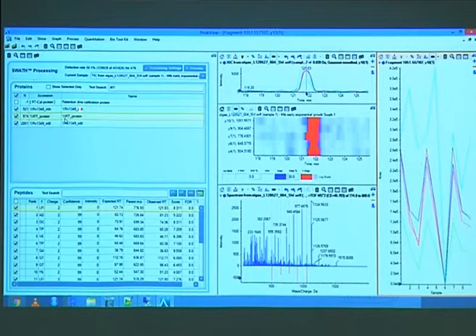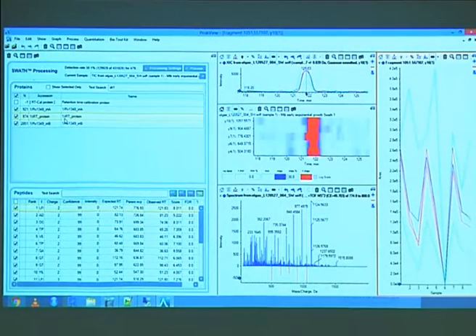Since it is a duplication of assays, since we get the information for that protein anyway, I usually don't do it. In case you're only interested in a subset of proteins, you could go through the list and click on each of them. But that's kind of tedious to do. And it is the same thing as if you just filtered the library on SWATHAtlas level, imported it there, and did it like this.